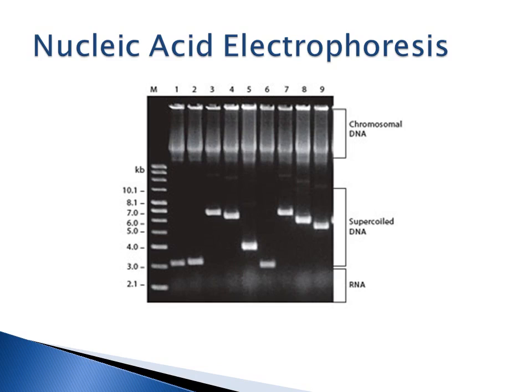So if you just did a typical organic nucleic acid extraction and ran it on a gel, this could be what you see, because you could see the chromosomal DNA. Let's say it's a bacteria that has plasmids. You could see your plasmid and you could see your RNA.